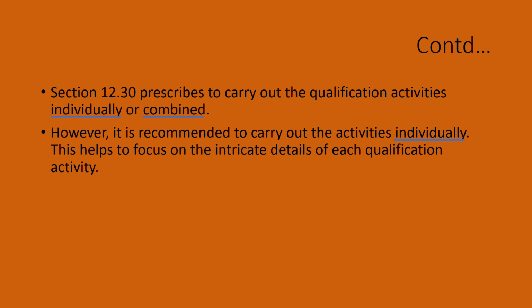This helps to focus on the intricate details of each qualification activity. So it is always recommended to carry out installation qualification individually. This way, the chances of missing any important and significant point can be avoided. If all are attempted at once, there is a tendency to take shortcuts.